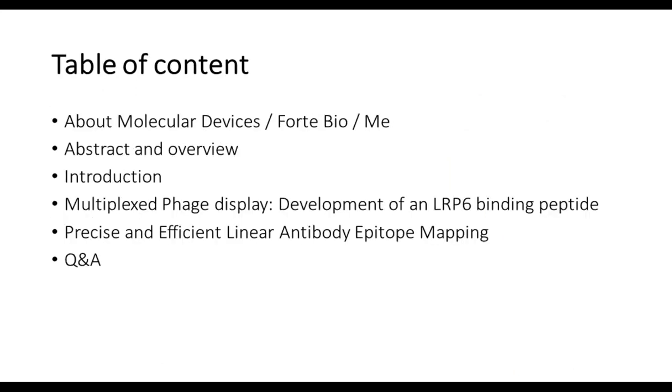All right, let's get started. So, a little bit about myself, you already heard that, as well as ForteBio Molecular Devices. Now we'll give you an overview about the technology, so you know what to expect from this webinar. A brief introduction to phage display for those who aren't that familiar with this topic. And then we're going to have two main topics, which is the introduction of the technology itself by an example where I develop a peptide binding to LRP6.